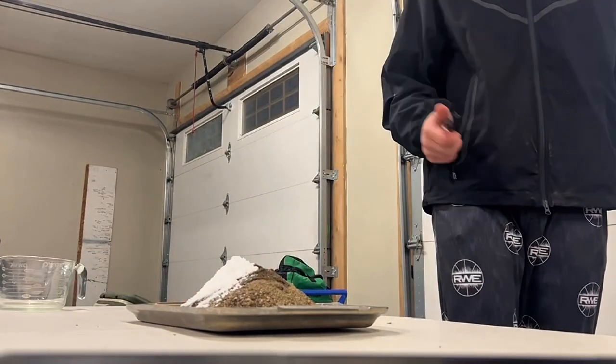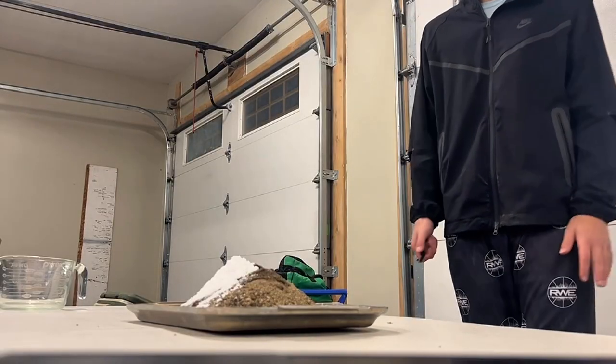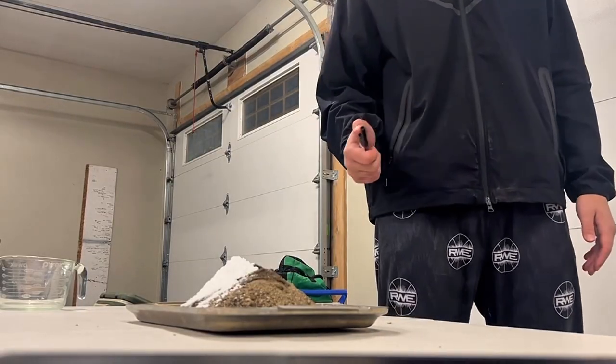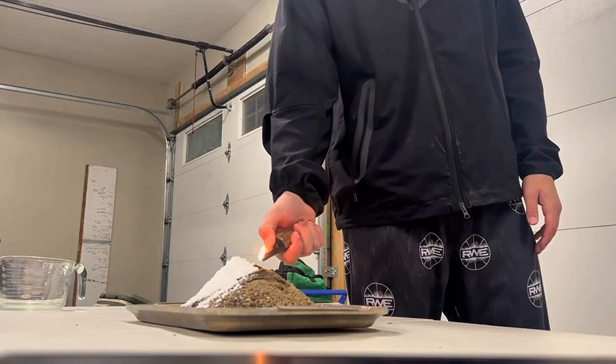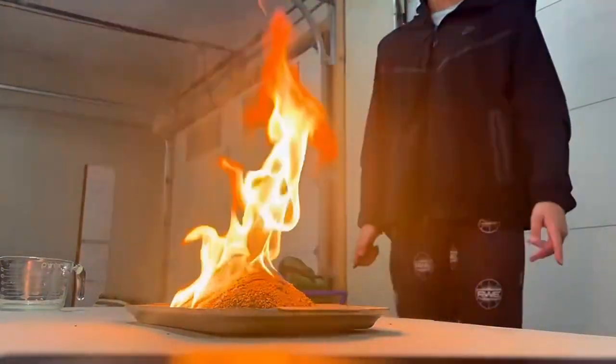We're gonna light it carefully this time. Last time was a big kaboom, so we gotta be careful. Should have had safety glasses on, but it's too late. Here we go. Ooh. This one's going on time lapse.